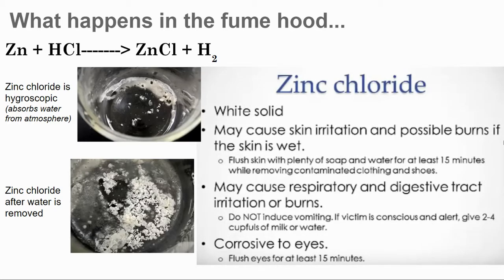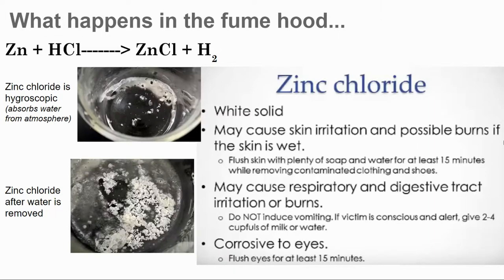Zinc chloride itself is a white solid. It can cause skin irritation and possible burns. If your skin is wet, you would just want to wash that part of your body with soap and water for a good 15 minutes. It can cause respiratory and digestive tract issues or burns. You wouldn't want to make yourself vomit, but we would make sure we'd get you some milk or some water. And then it's corrosive to eyes, so you'd want to clean those eyes out.